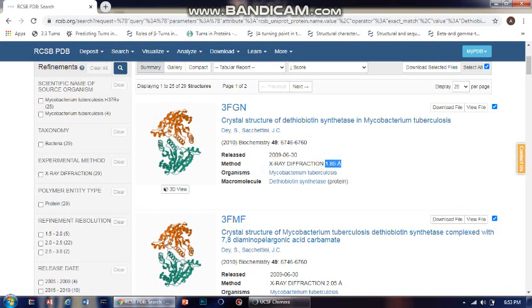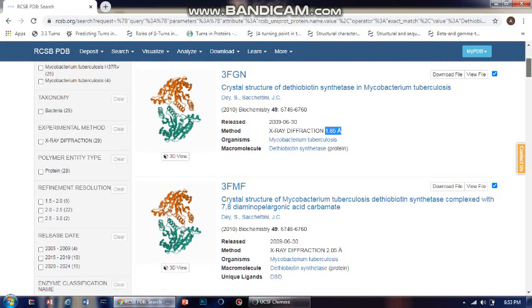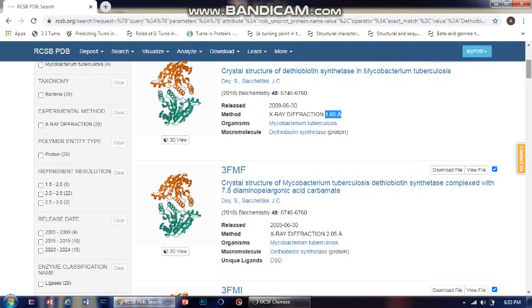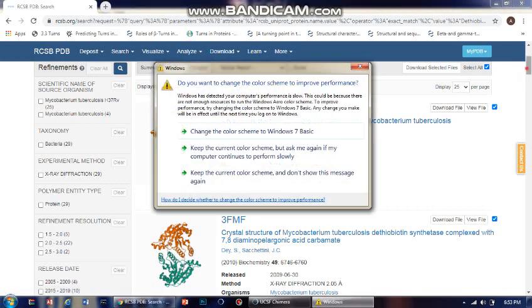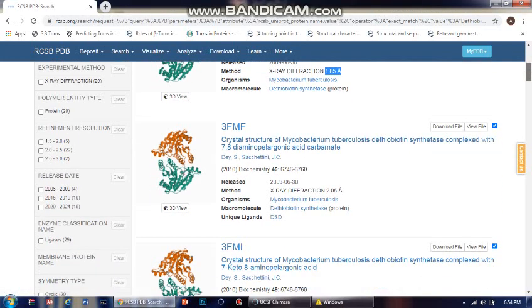I can see that this crystal structure does not have any associated ligand or compound. In order to visualize the crystal structure of the independent protein — independent in the sense that it is not complexed with any coenzyme, cofactor, or other protein — this entry is pretty good for that purpose.